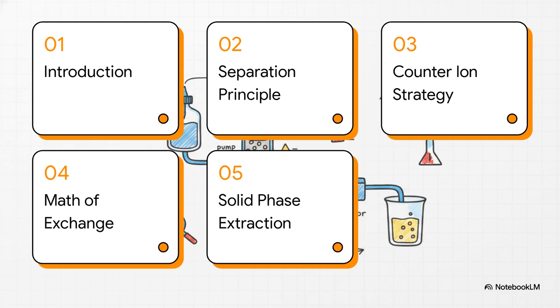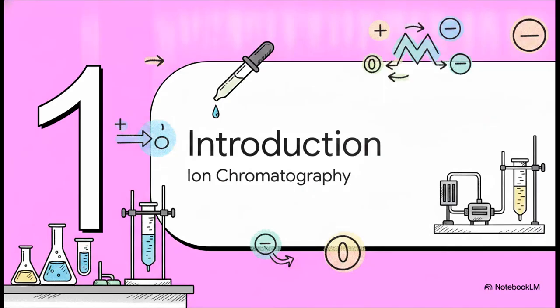We'll start with 1, Introduction to Ion Chromatography, move into 2, the principle of separation, look at 3, the counter-ion strategy, dig into 4, the mathematics of exchange, and wrap up with 5, solid phase extraction. Let's get to it. Section 1.